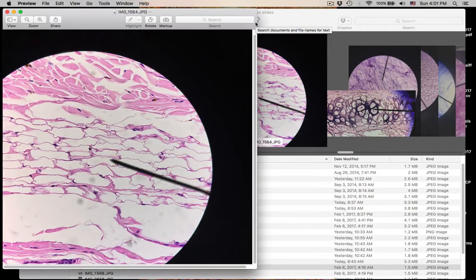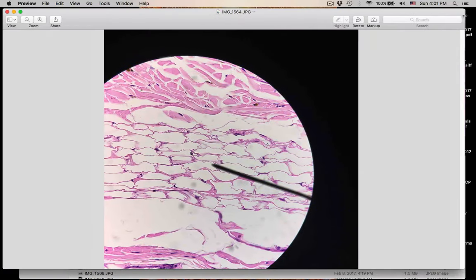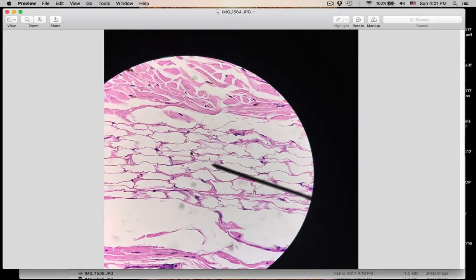This is pretty clear. The pointer is in a cell, but what is the name of this connective tissue? This is number eighteen.